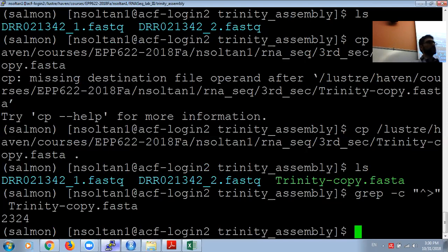By this tool, you can say my assembly is good from the aspect of nucleotide, and also from the aspect of protein. That's why we use this tool to verify and confirm the assembly is working well for us.